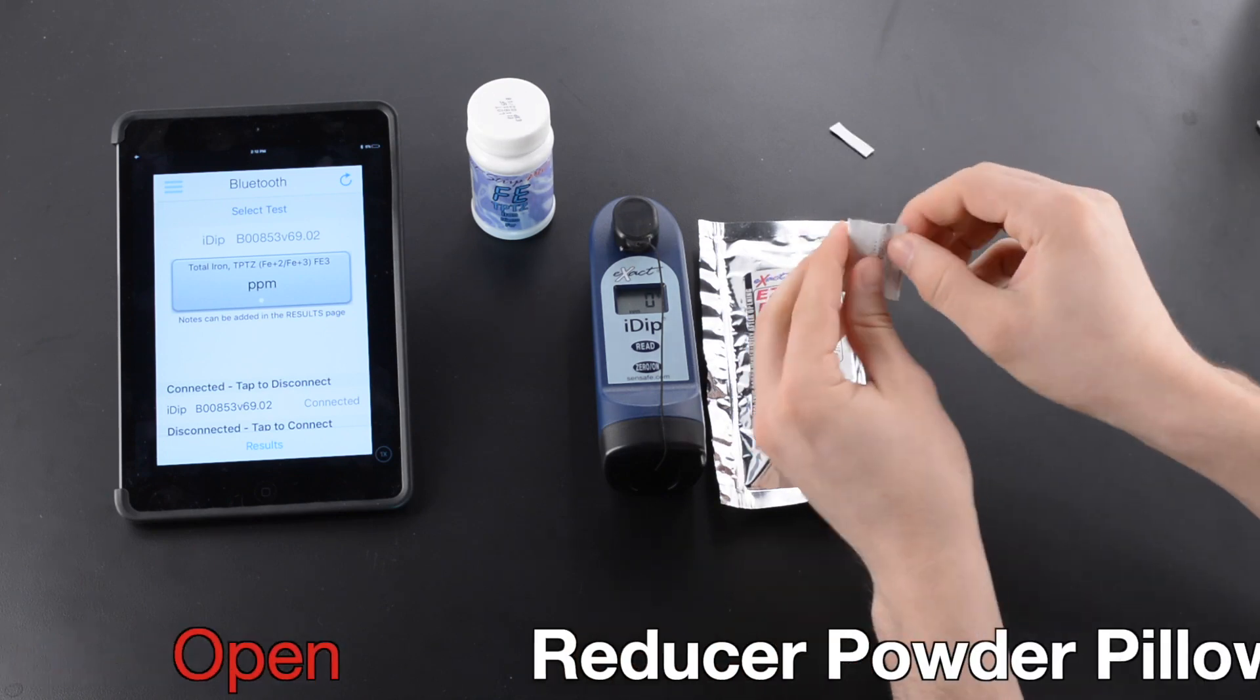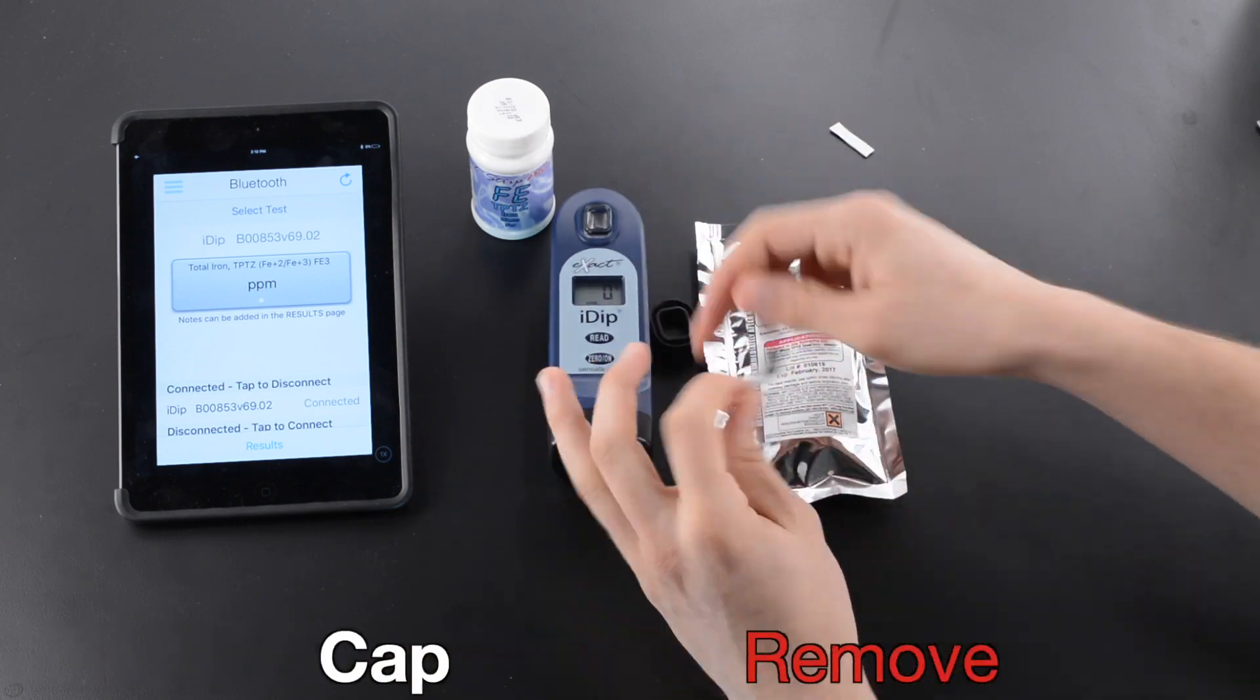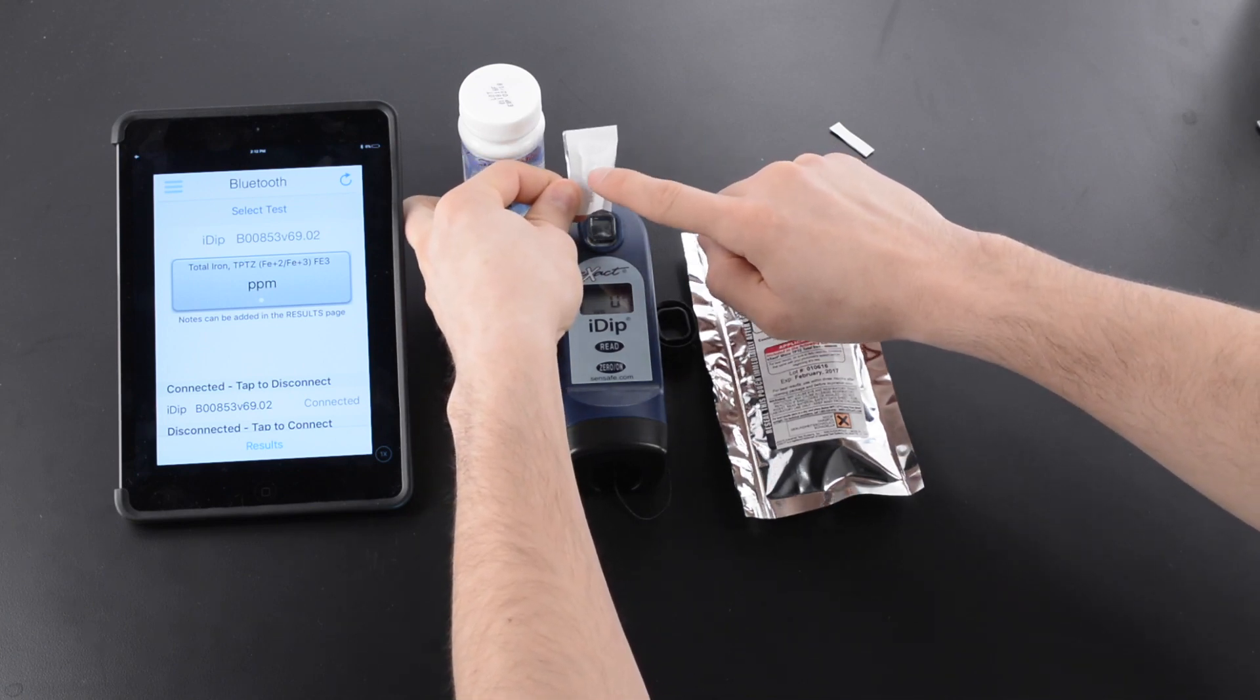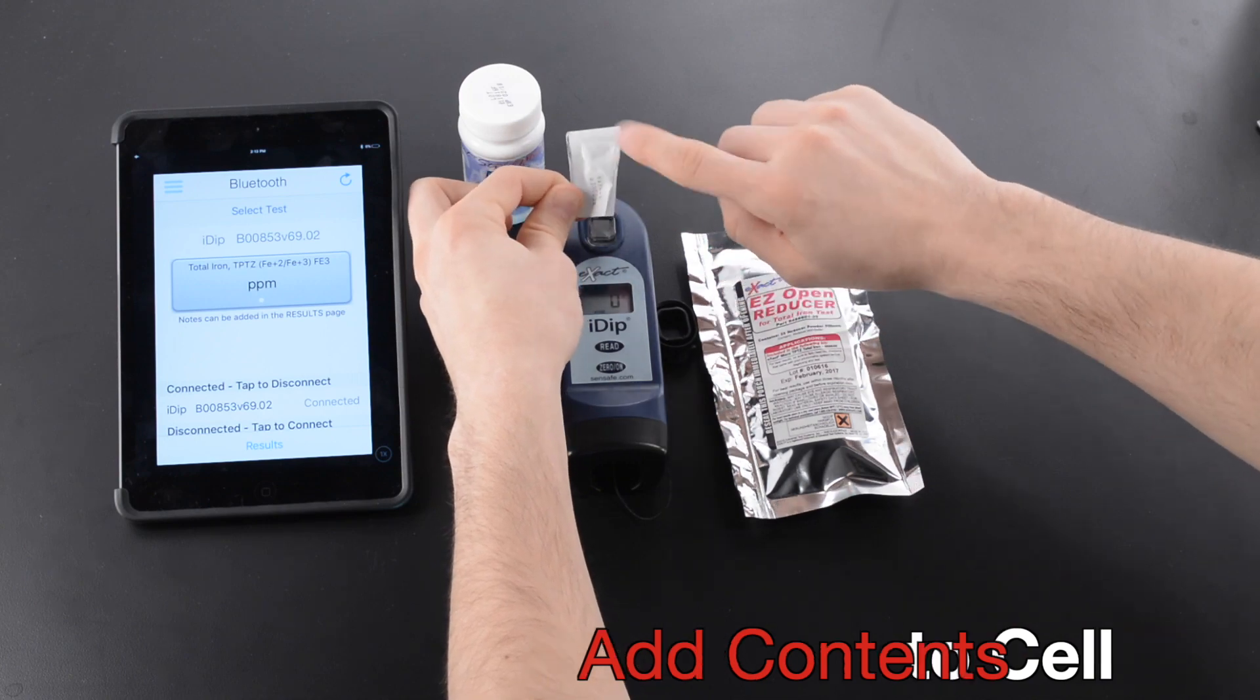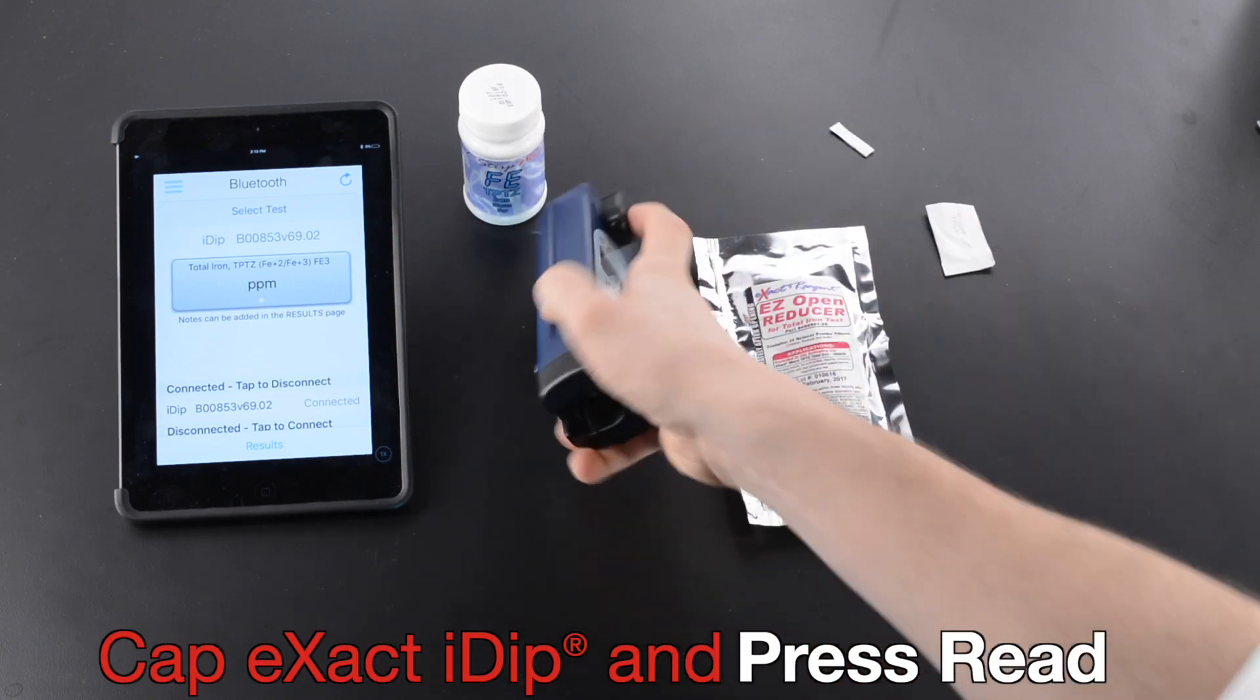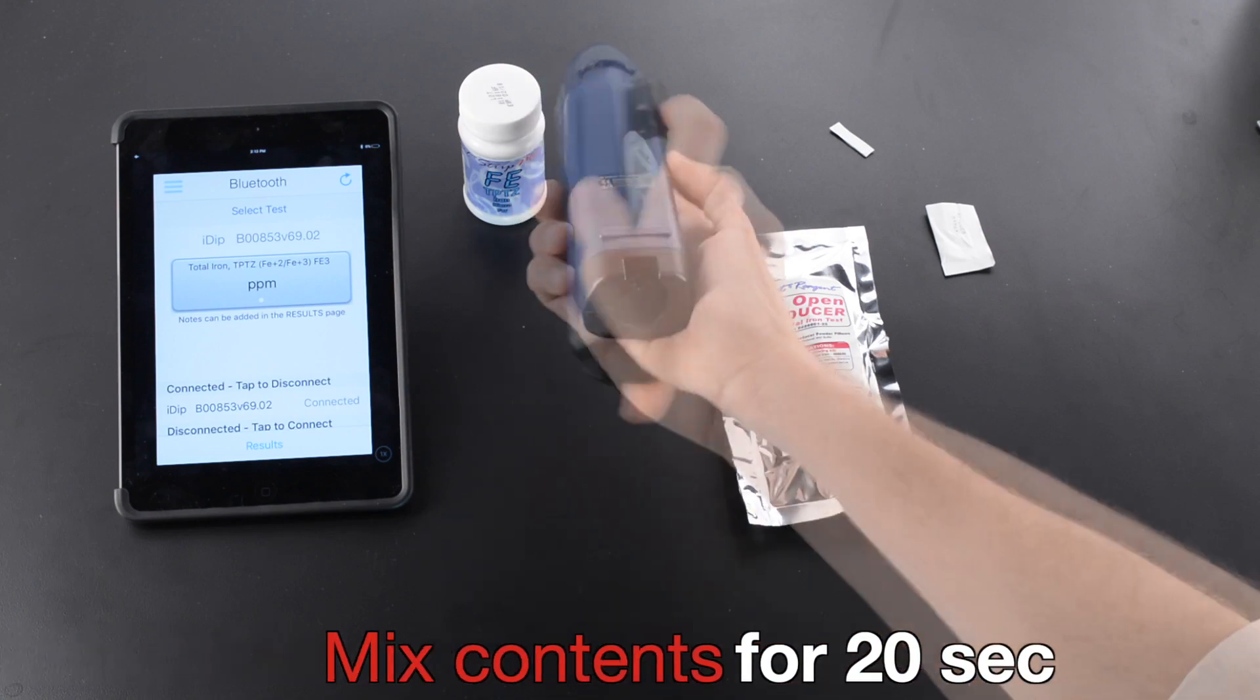Open Reducer Powder Pillow. Remove Cap. Add Contents to Cell. Cap Xact iDip and press Read. Mix Contents for 20 seconds.